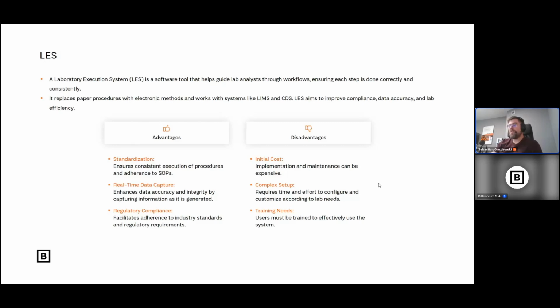In such a system, you often can do some kind of instrument and reagent management. And also, one of the main benefits is to connect this kind of system to other systems like LIMS to get samples, chromatography systems to get information from your chromatography, and other systems to retrieve information from your other lab equipment like balances or pH meters or UV meters.